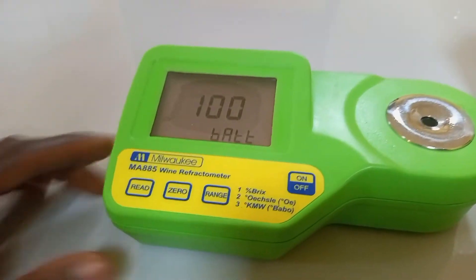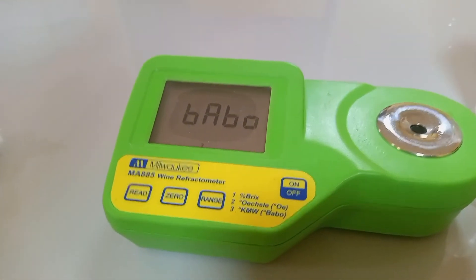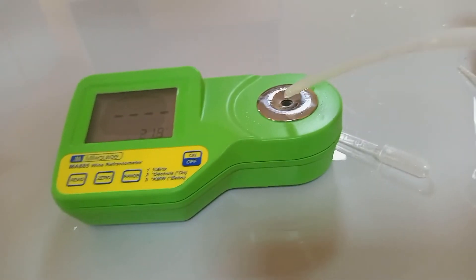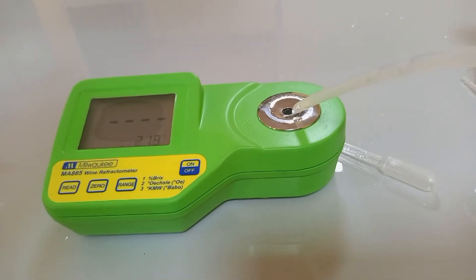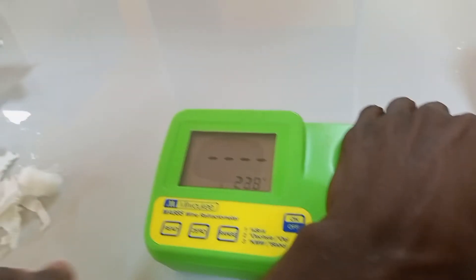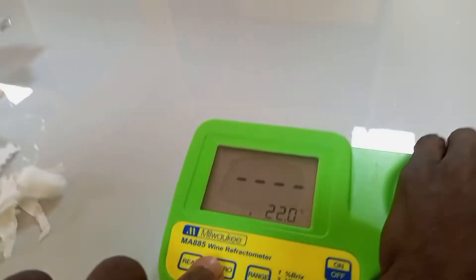On the instrument, take note of the temperature. Zero the instrument with distilled water. Reduce the light interference, then press zero.